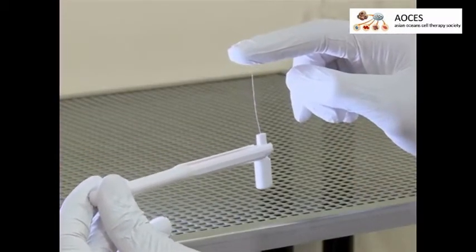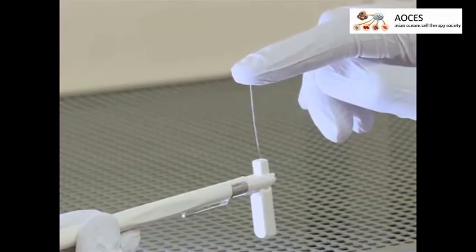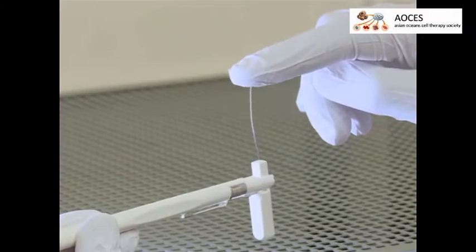For the testing, use von Frey filaments — these plastic hairs of calibrated diameters are attached to a handheld applicator. When bending, each filament exerts a pressure proportional to its diameter. In mice, the most often used filaments range from 0.16 to 10 grams.